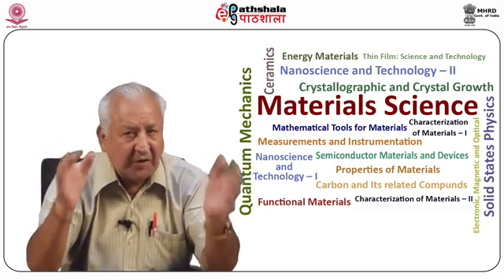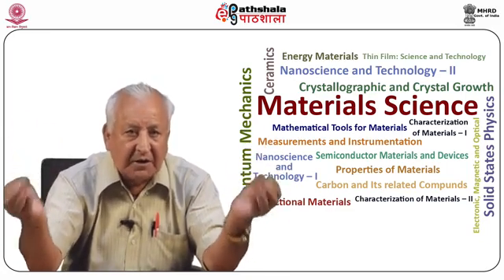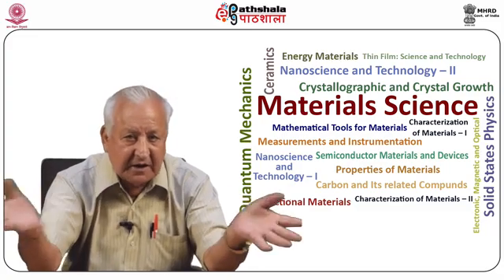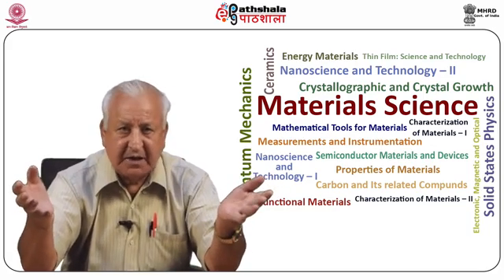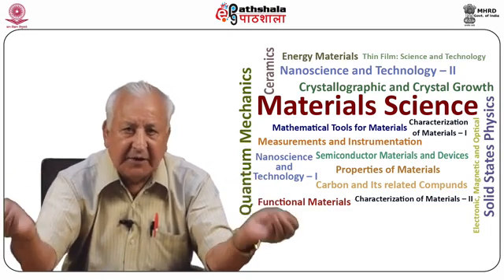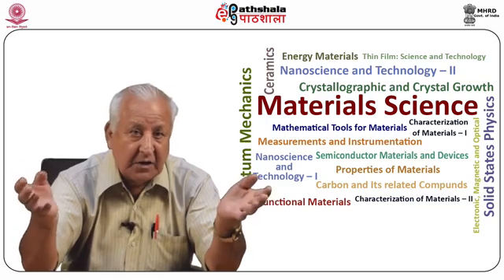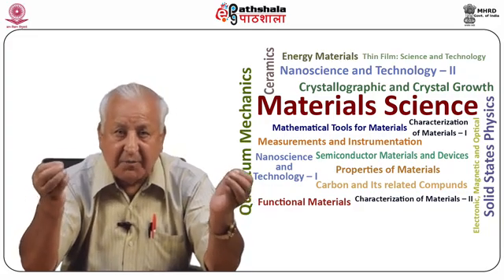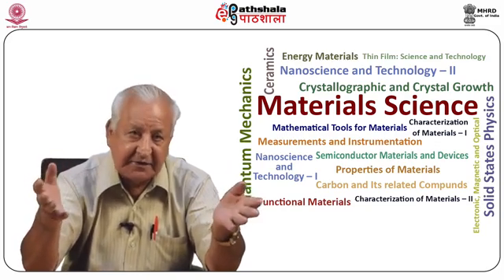Further, reflections are possible not only from the different set of planes but also in the orders for each set. The powder crystal method is the only technique which is readily available to all crystalline solids. The diffraction data, which depend on the lattice parameters, are unique for a given material and therefore can be used for its identification. To identify a human being, we make use of his fingerprints. In the same way, diffraction data of powdered crystalline samples are unique and become a means of their identification.